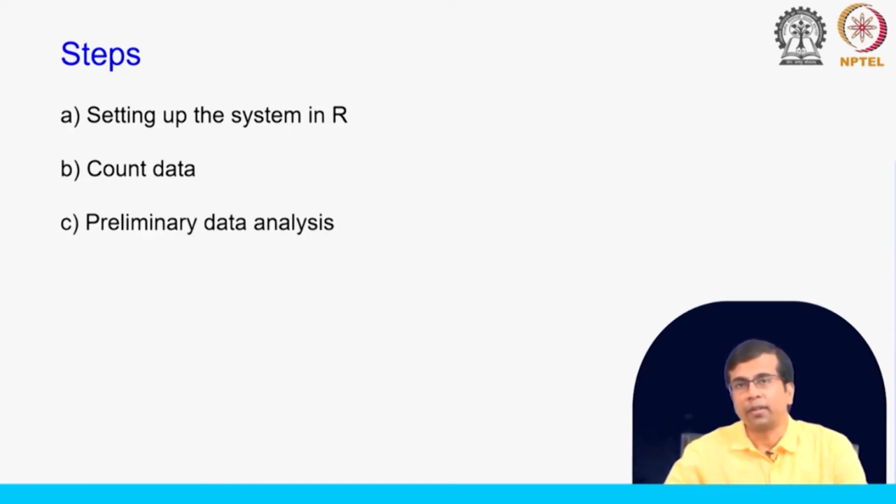Then the first part of this analysis is the preliminary data analysis. You remember we have talked about two different methods. One was the distance based clustering and the second one was the principal component analysis. These preliminary data analysis methods allow us to understand what would be the best comparisons to make, whether some samples are similar to each other or different, and they can identify the best groups for comparison.